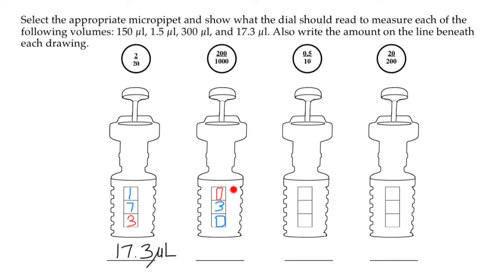Again, the red color here means that we have a decimal point here. But how come we have 300 microliters here and here we have only 30? Actually, this stands for the hundreds and this stands for the tens. And this first line stands for the thousands. So 300 means 0.30 milliliters. Or we can say 300 microliters.